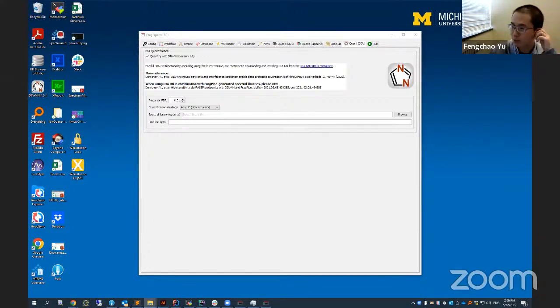And you can run small data and then let it generate the library.tsv. The name is library.tsv, and take a look at the format. And someone asked, does the optional spectral library option select? Yes, it is. It selects a spectral library here and is used for that.